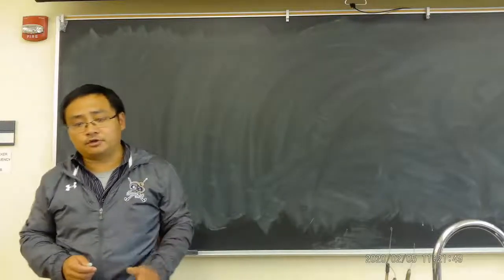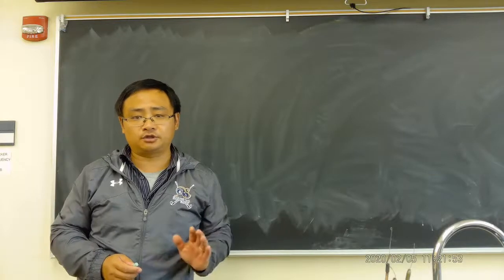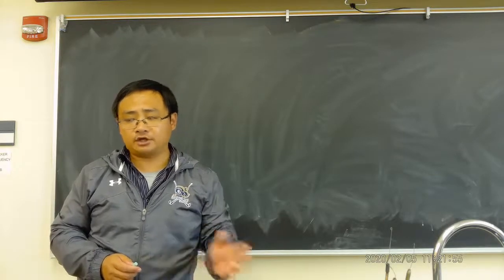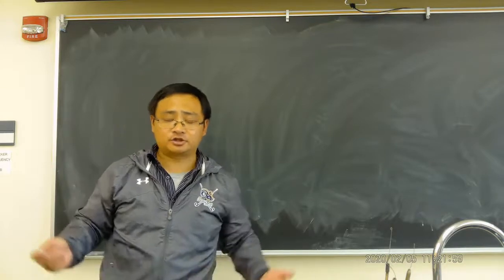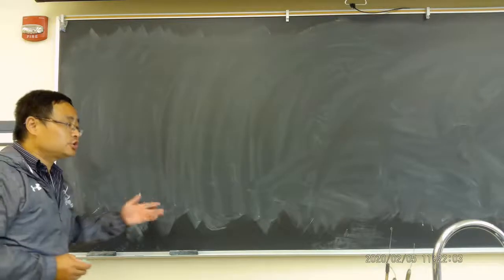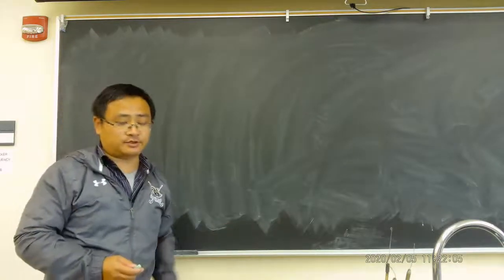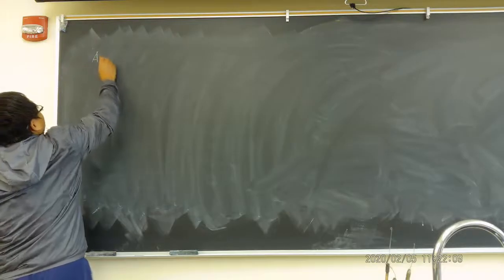So the third module, we're going to do the acid fast stain. We're only going to do a demo, which means we're not going to practice in the lab because we don't have mycobacteria, any species. So we're going to do a lecture related to the lecture exam, also the lab exam, but we're not going to practice. So, acid fast stain.